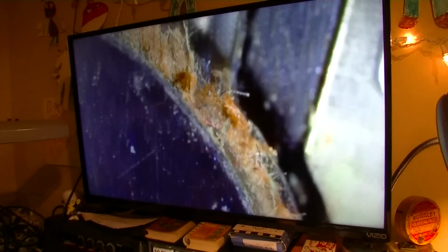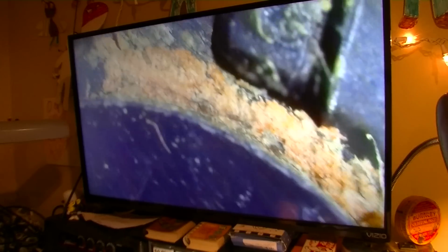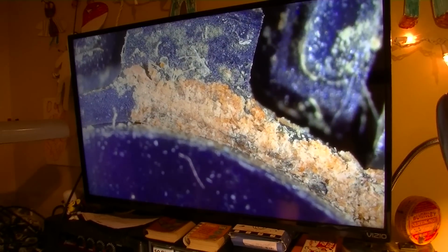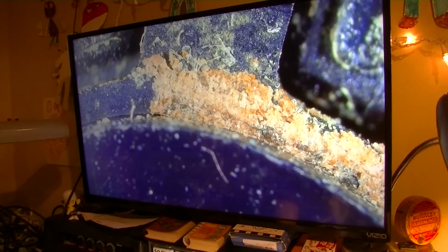This is just some finger crud. Look at this crap. Hang on. Let's see if we can actually focus on it. Can't focus far in enough. It's too close. There we go. Look at that. Yummy. Look at that. What the f is all of that? What is that? Skin cells and who knows what else.